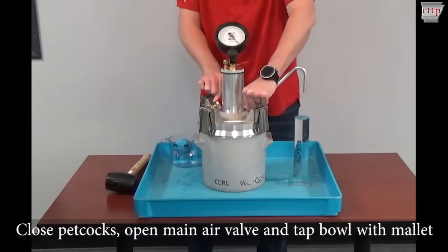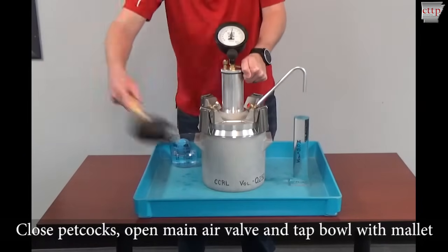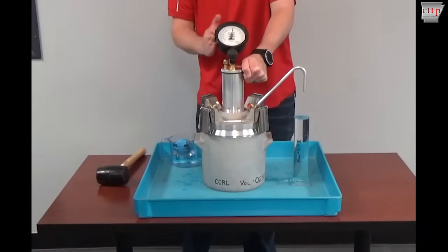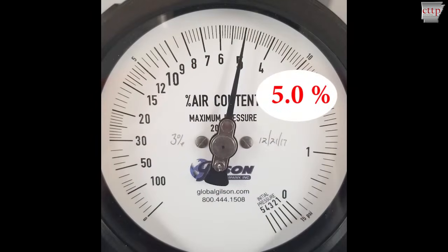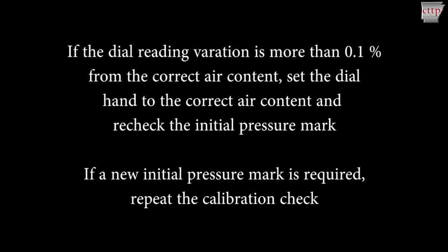Close both petcocks, hold the main air valve open, and tap the sides of the bowl with the mallet. Tap the dial gauge lightly with your fingers to stabilize. Once stabilized, read the dial gauge. The dial reading must match the amount of water removed within plus or minus 0.1%. If the dial reading variation is more than 0.1% from the correct air content, set the dial hand to the correct air content and recheck the initial pressure mark. If a new initial pressure mark is required, repeat the calibration check of the dial readings.